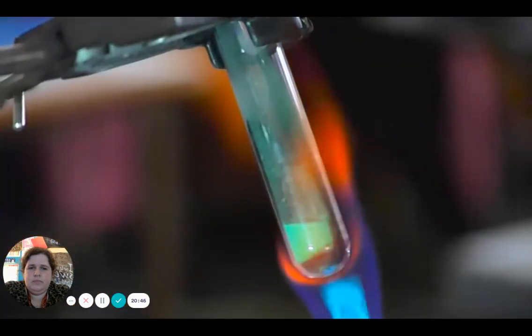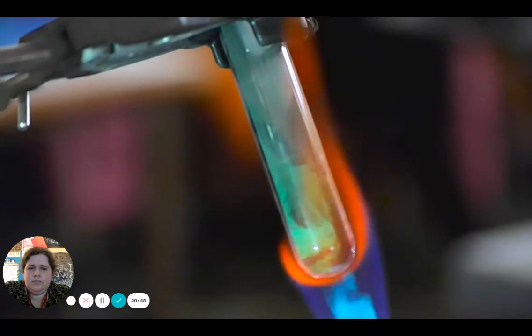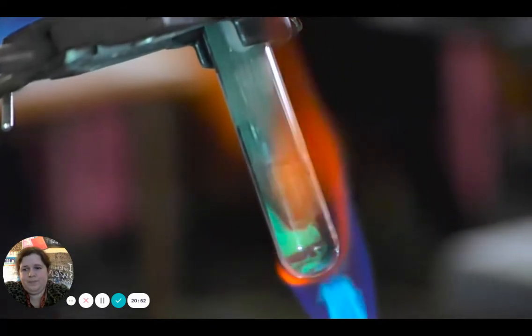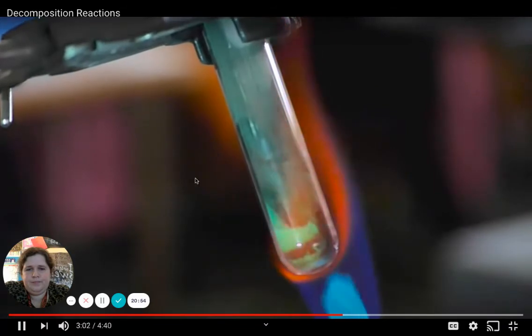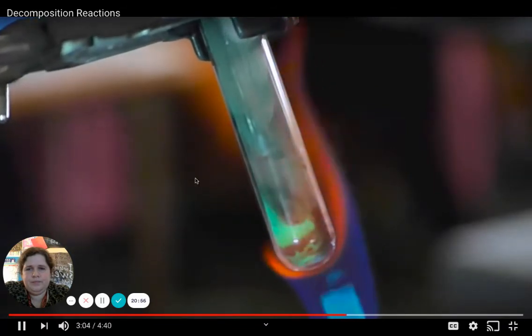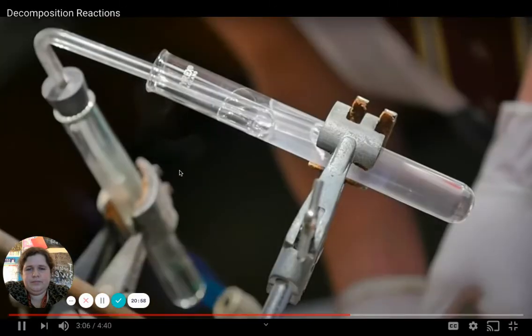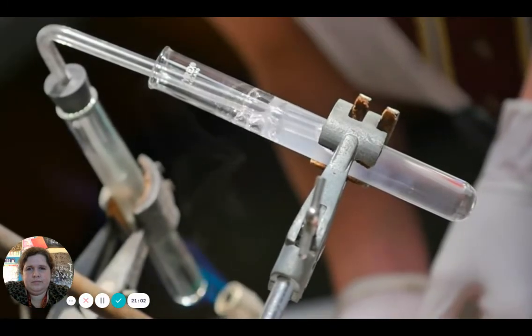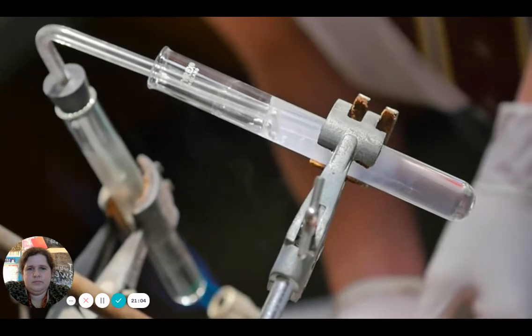What this is, has it disappeared entirely or changed somehow? Oh, it's changed. It's changed color. It's gone from green to black. We've created something different. What we've created here is copper oxide. So that's one of our materials. CuO, which we presume is this black color there. Solid.